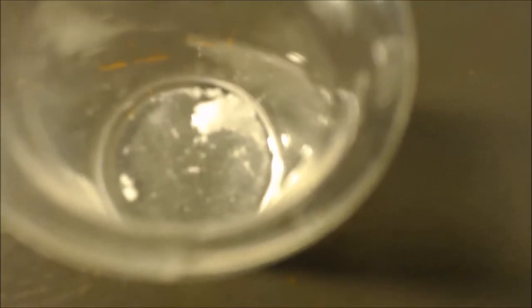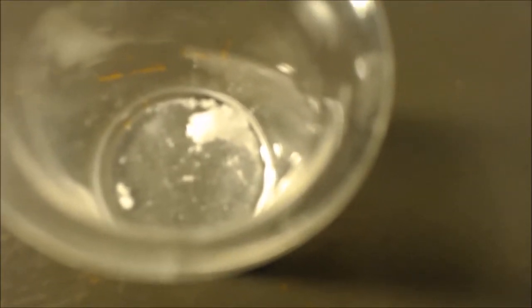That isn't fizzing that much. Maybe a lot of it is potassium acetate. That big chunk I put in there, it really smells like vinegar. Well, let's try this.